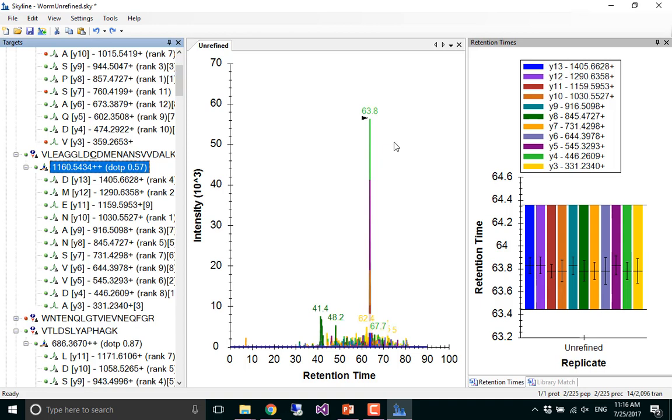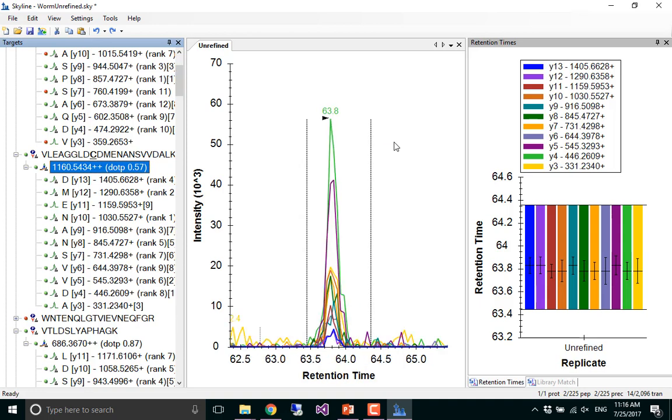So these early refinement runs, we don't have any retention time information. So we just measured the entire gradient. And again, maybe that would be true if we're looking in DIA or something. There are more sophisticated methods to get to this information, but you should know how this is possible. And then F11 to zoom back in. So yeah, we're measuring over the entire gradient, 2,000. So that would mean that we'd have to have a mass spectrometer that could comfortably measure 2,000 transitions in a loop. Which I don't know of any that can.